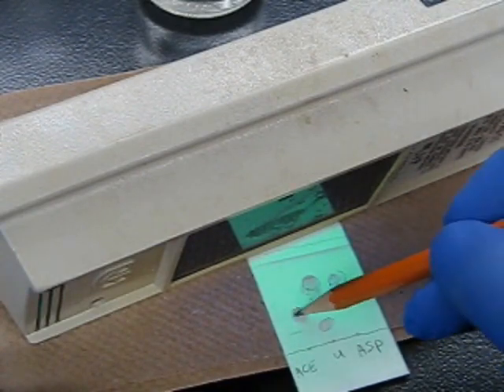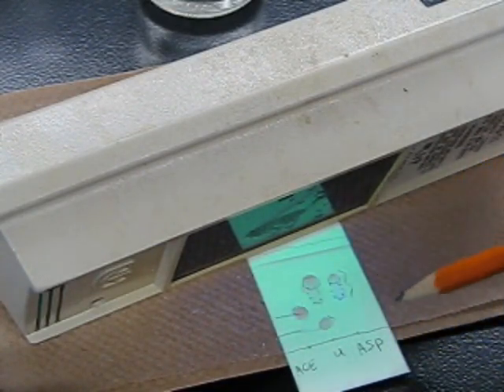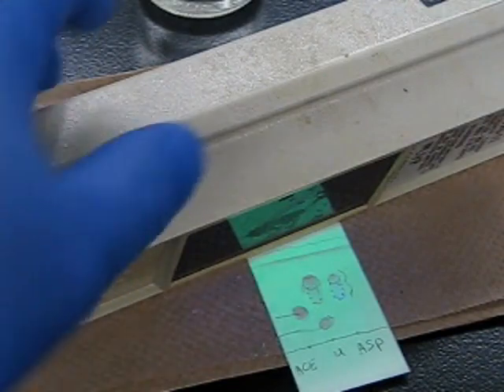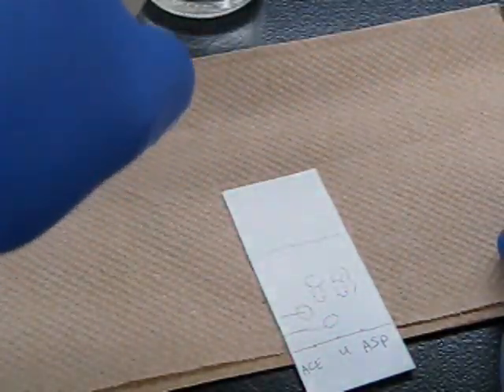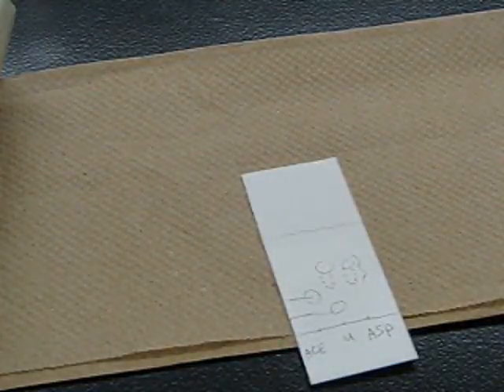If you look at this sample, the unknown and acetaminophen don't match up in their vertical spots. The unknown does seem to contain some aspirin, but there's something else in there, so you'll find that out when you run your other two reference compounds.